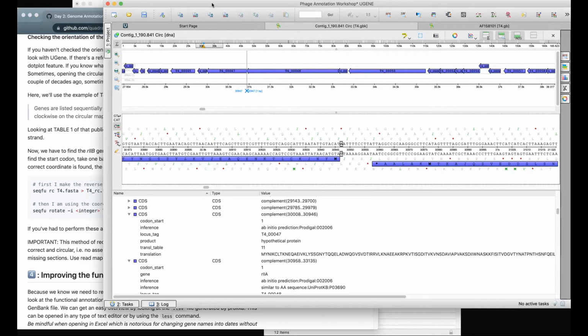Question, because I thought that when you use phage term, it also gives you the right orientation of the phage genome. That is only for genomes that have, for example, a defined end, or which have a defined packaging site, which starts packaging, and then you can find the orientation.